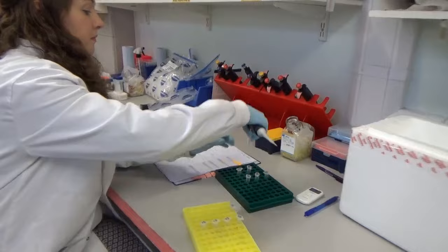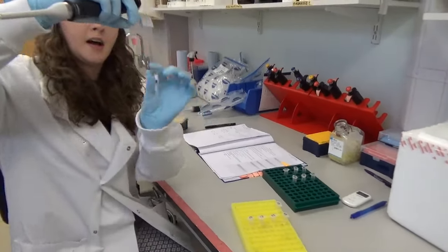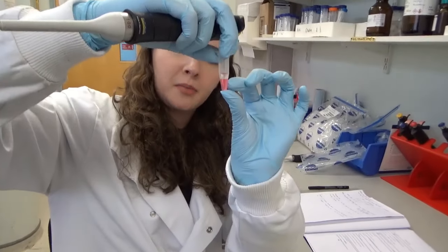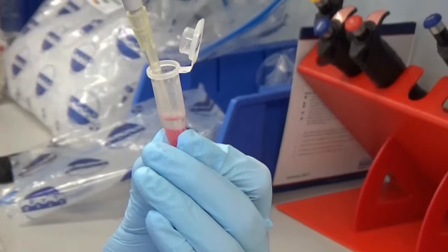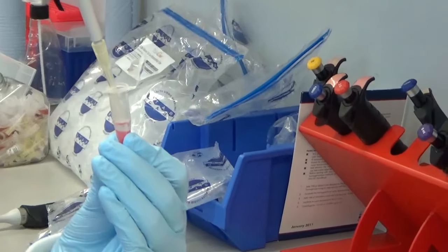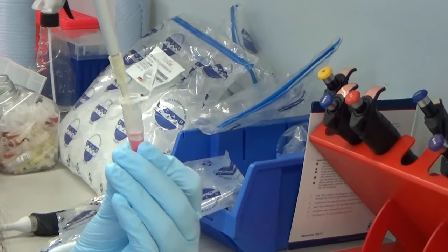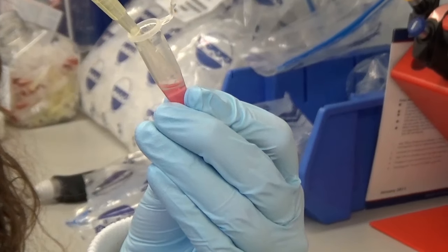So basically it just involves trying to be really careful and taking off the top layer and leaving the middle layer and the bottom layer. Don't know how well you can see that. So I'm just taking that layer off and putting it into a new tube. So that has the RNA, and after that I'm going to purify the RNA a little bit more, and then that will go on for analysis to see what microRNAs are in there.